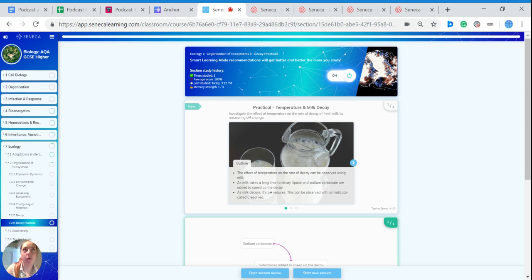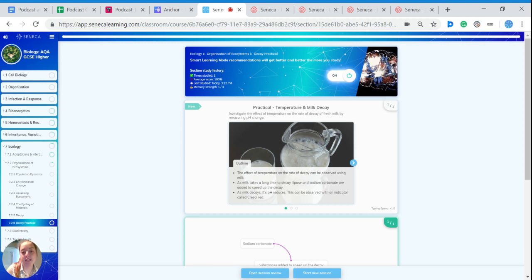So let's see what happens. We're going to investigate the effect of the temperature on the rate of decay and we're going to observe this using milk.